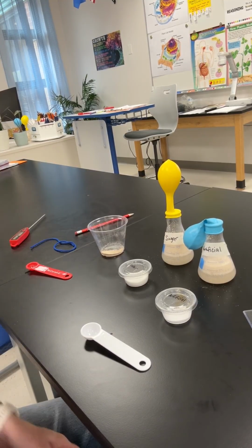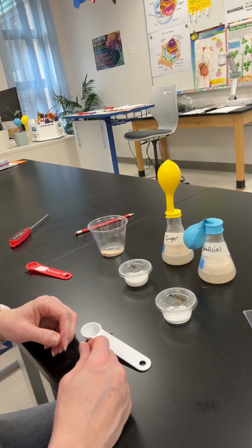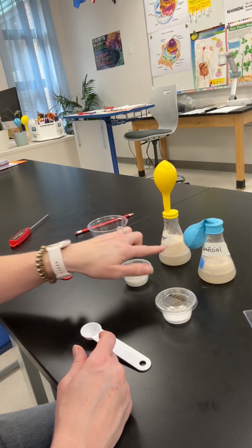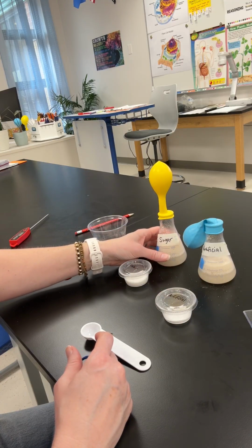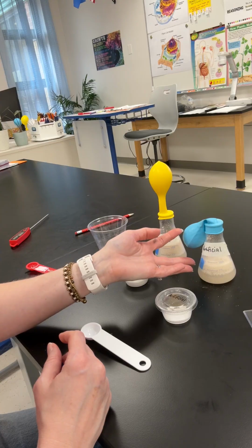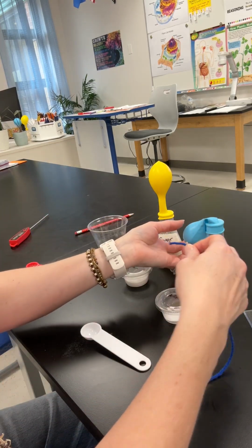Okay, so now we're at the 10-minute mark. You can see our sugar, the bubbles are a little bit higher, it's right here, whereas the artificial is still a little bit lower. So we're releasing a little bit more gas in the sugar than we are in the artificial. The artificial is increasing, you can see, it's just not as much.